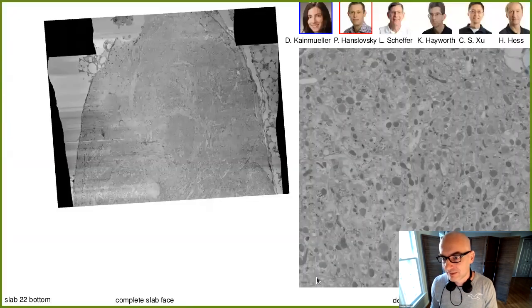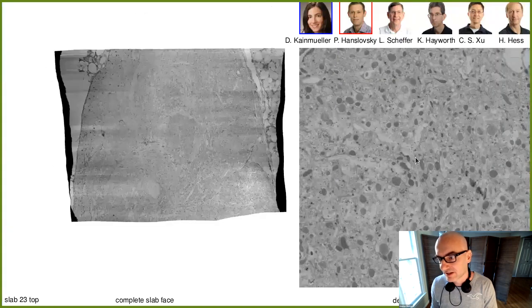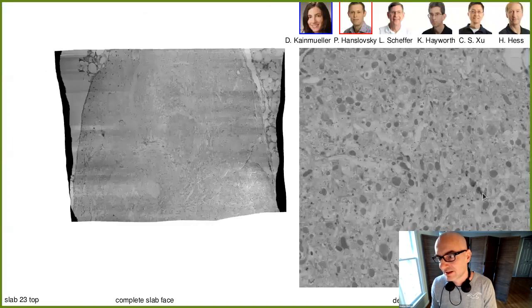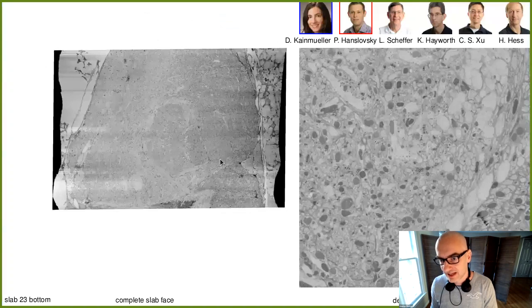So that further refines these images, and well, at this resolution you can't see the difference of these flow fields. But if we zoom in and look at a few examples, you can actually appreciate how well this aligns between these data sets. So here we see the transition between the first two things. This is a zoom in, and you can also see that there are often strange differences. It's not immediately adjacent.